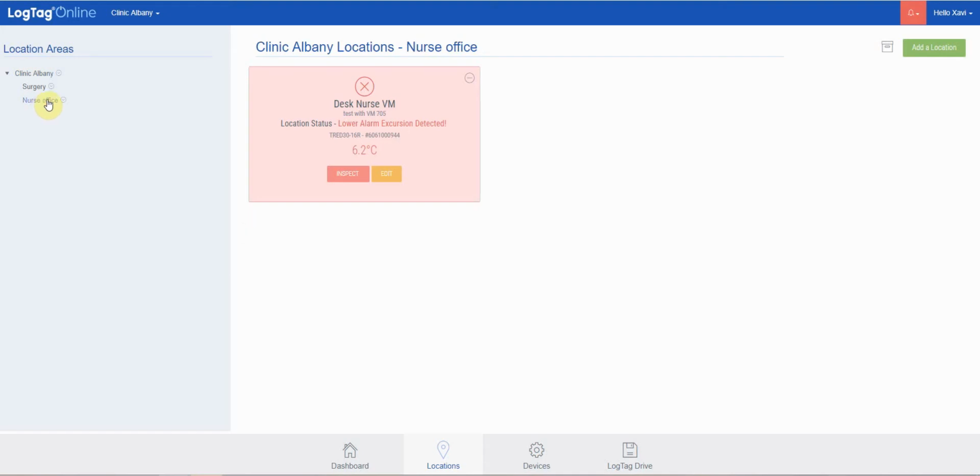Areas allow permissions to be given to users and to locations, or our temperature monitoring zones, so that only users who have been assigned within that area can see those temperature data. So you can restrict access to a specific fridge, freezer, or location by placing that within an area.